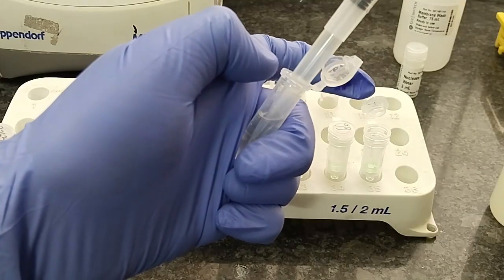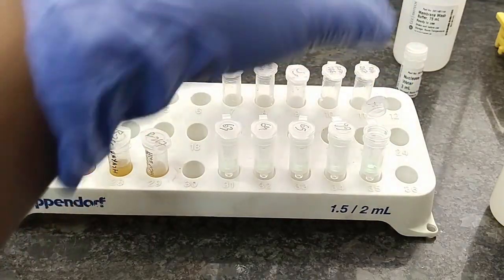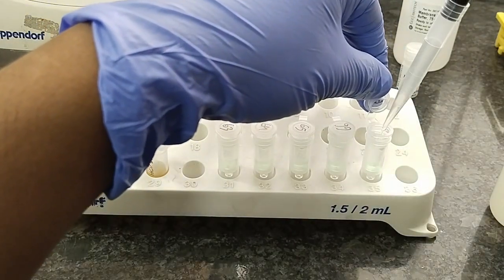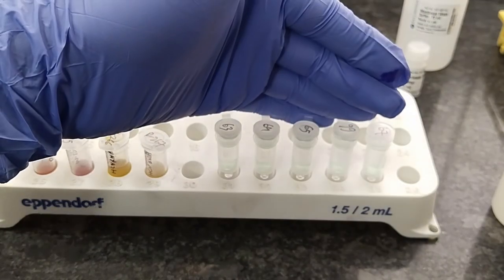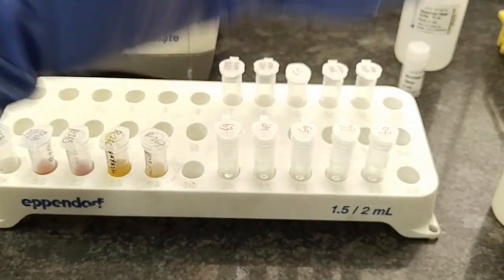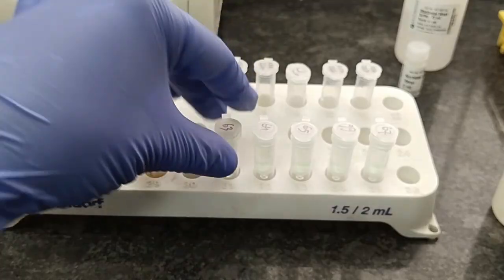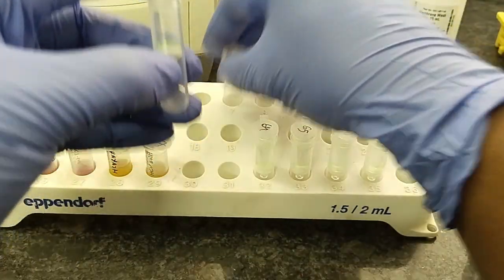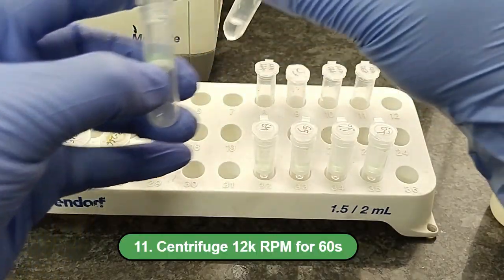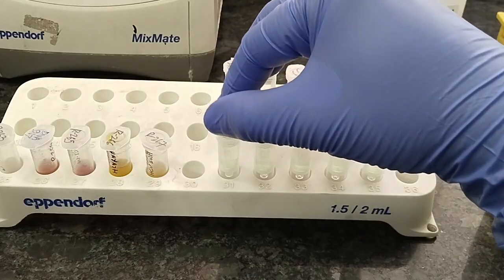Add 700 microliter of solution to the binding column. Then centrifuge the binding column at 12,000 rpm for 30 seconds at room temperature.